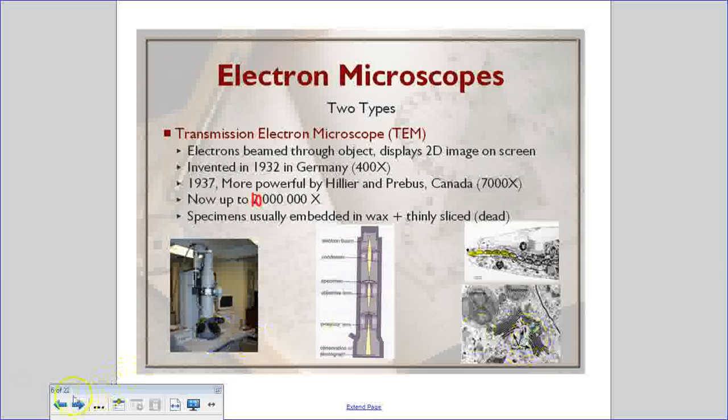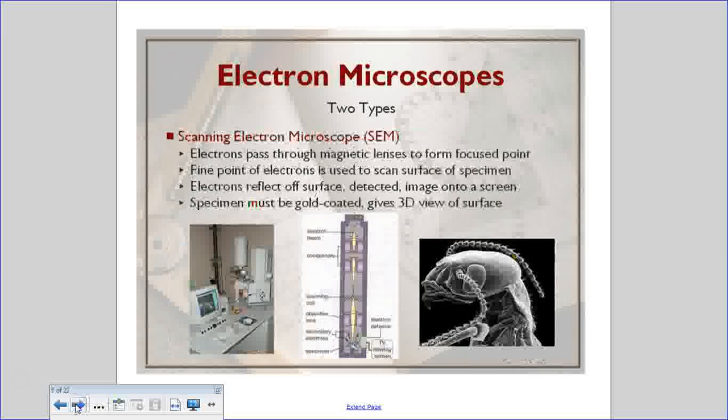But in this case, you can see a lot of detail, which has allowed researchers to learn a lot more, whether it's from medical research or learning about parts and functions of different organisms. You name it. It's really, really allowed us to learn a lot more about the microscopic world and cell parts and how they function, and if something's wrong, what's going wrong, things like that.